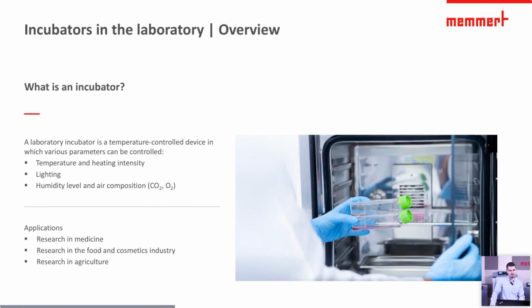What is an incubator? An incubator is a common laboratory device for culturing cells, tissues, organisms by simulating a growth environment at a specific temperature, humidity, light, or CO2 concentration, and is widely used in the fields of plants, organisms, genetics, viruses, medicine, environmental protection, low and constant temperature testing. Typical fields for application are the medical research, research in the food and cosmetic industry, and the agriculture research.